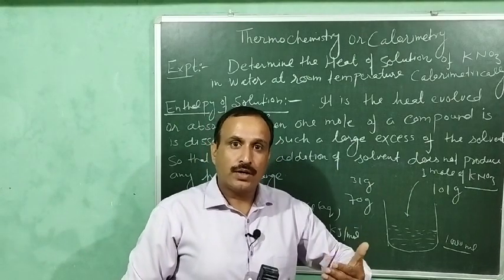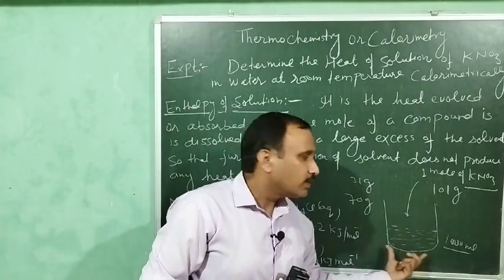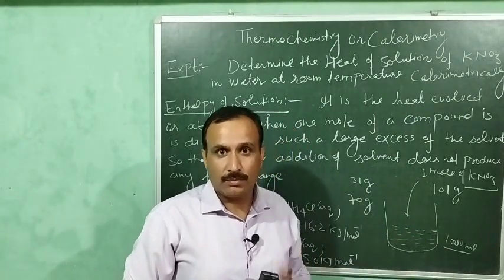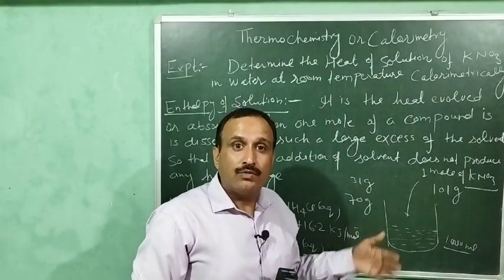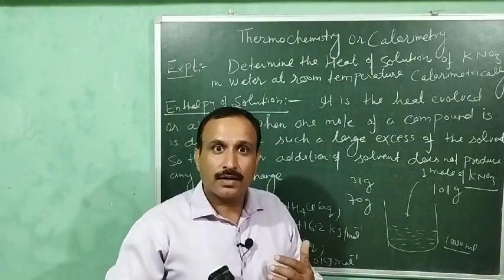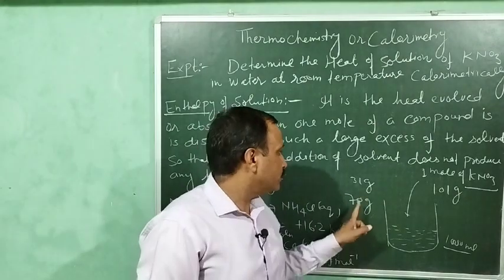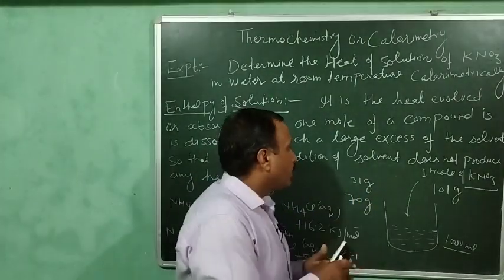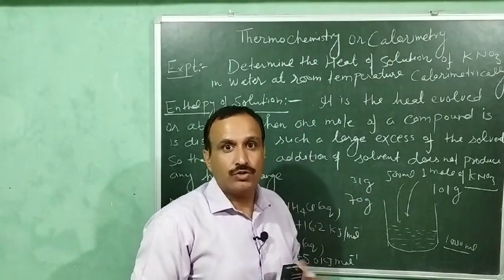जब पोटाशियम नाइट्रेट जो है वाटर में डिज़ोल्व होता है तो ये हीट एब्जॉर्ब करता है वाटर से भी और द कंटेनर से भी जिसमें हमने ये वाटर लिया है. तो इसका जो डिसोल्यूशन है वो कैसा है, एंडोथर्मिक है. दिस मीन्स दैट व्हेन दिस 70 ग्राम ऑफ पोटाशियम नाइट्रेट विल डिसॉल्व इट विल एब्जॉर्ब हीट फ्रॉम द वाटर एंड द कंटेनर, और जो हीट ये एब्जॉर्ब कर रहा है वही है आपका हीट चेंज या इंथैल्पी ऑफ डिसोल्यूशन ऑफ दिस 70 ग्राम. ओके, नाउ व्हाट आई डू, आई ऐड मोर 500 ml वाटर इनटू इट, into this container.